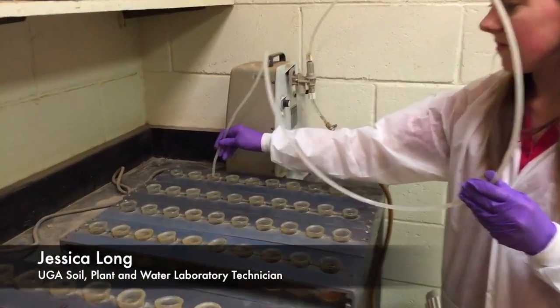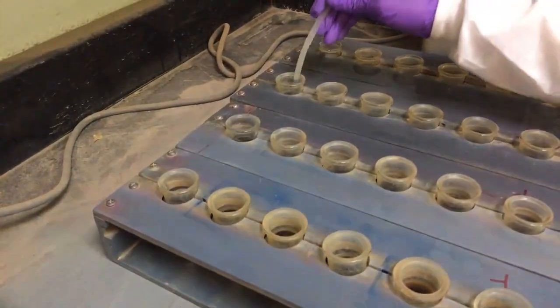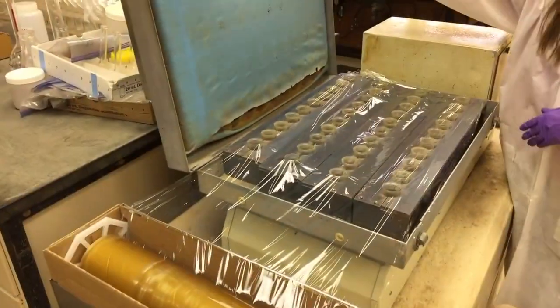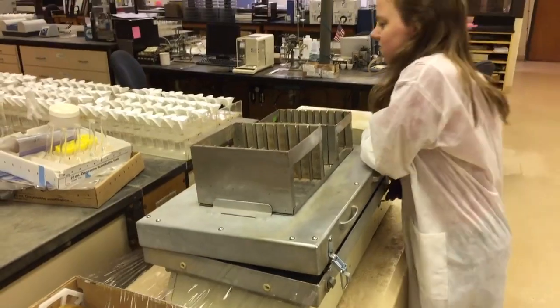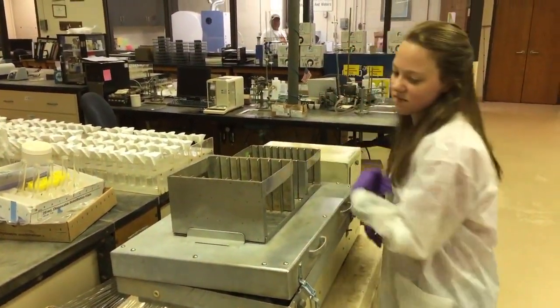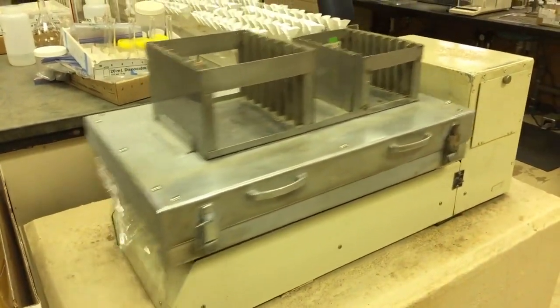The batch being tested for mineral content gets treated with a weak acid solution to quickly extract minerals from the soil. It's possible that the soil lab in your state will use different chemicals or tests than what you see here, because soils vary dramatically across the map, and each lab will use the best test methods for their state soil types.